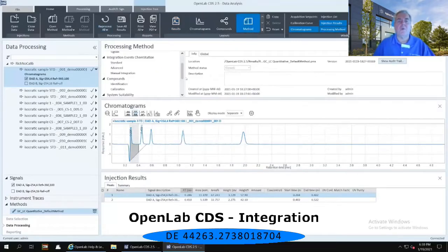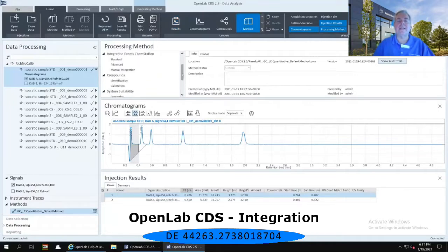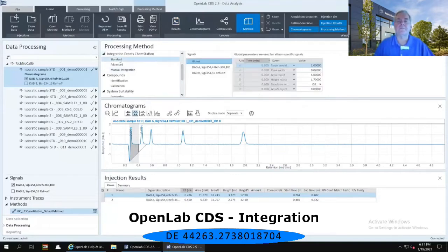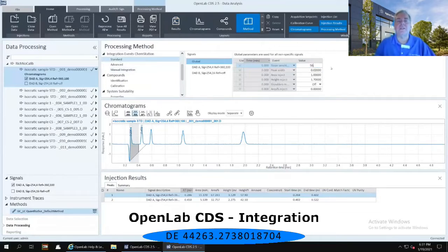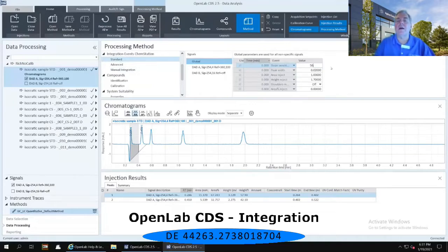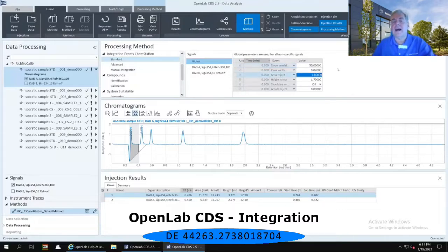In the method layout, I'm going to use my scroll bar to go down to where it says Integration Events Chem Station and select the standard integration events. The first thing I'm going to do is change the slope sensitivity from 1 to 50. Why 50? Because in 95% of integration cases, this is a good place to start. The peak width we're going to keep at 0.02. I'm going to drop the area reject from 1 to 0, and the height reject from 1.7 to 0 as well.